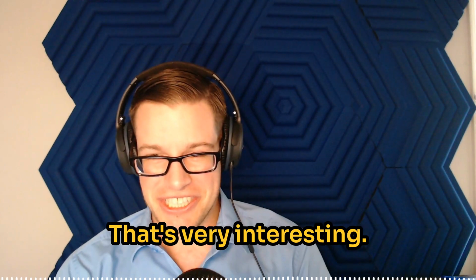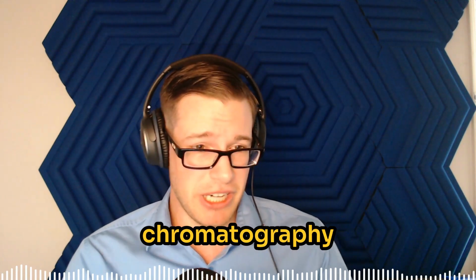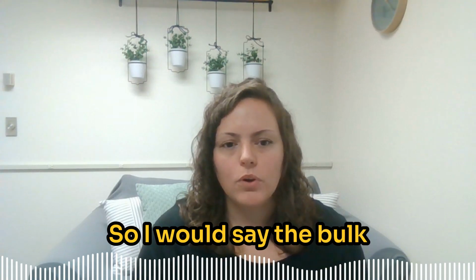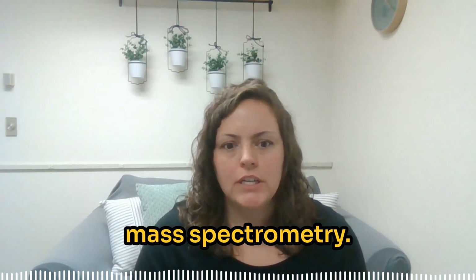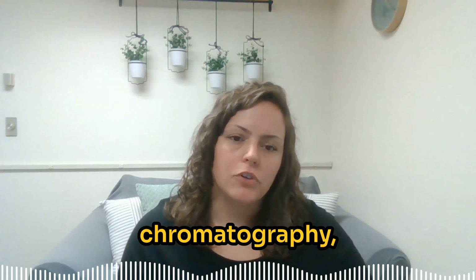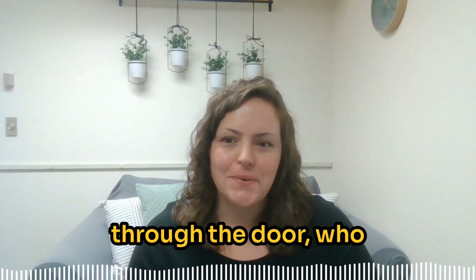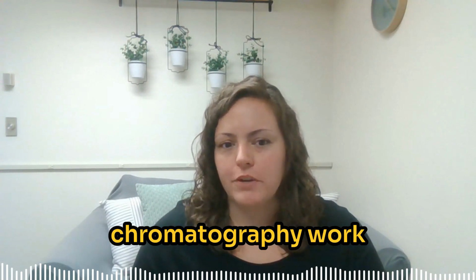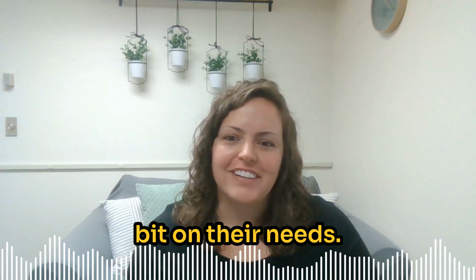That's very interesting. You mentioned HPLC specifically. Is that the type of chromatography that you're doing most commonly? Yeah, so I would say the bulk of our work is actually spectroscopy based. We do a lot of inductively coupled plasma mass spectrometry and inductively coupled plasma optical emission spectrometry. But in terms of chromatography, it varies month to month. Again, it really just depends on what's coming through the door, who needs what at that time. Recently, most of our chromatography work has been GCMS. We've been working with Matt quite a bit on their needs.